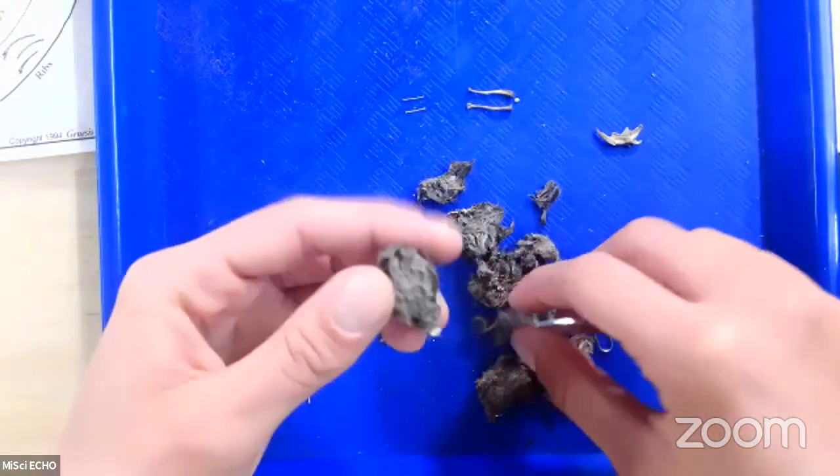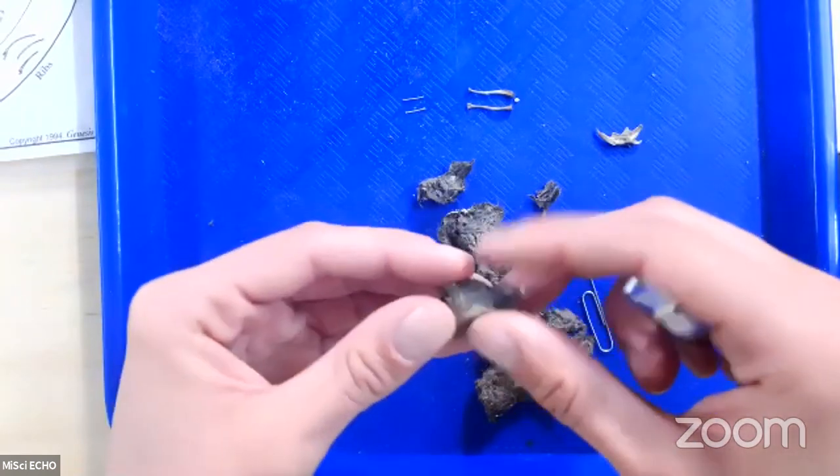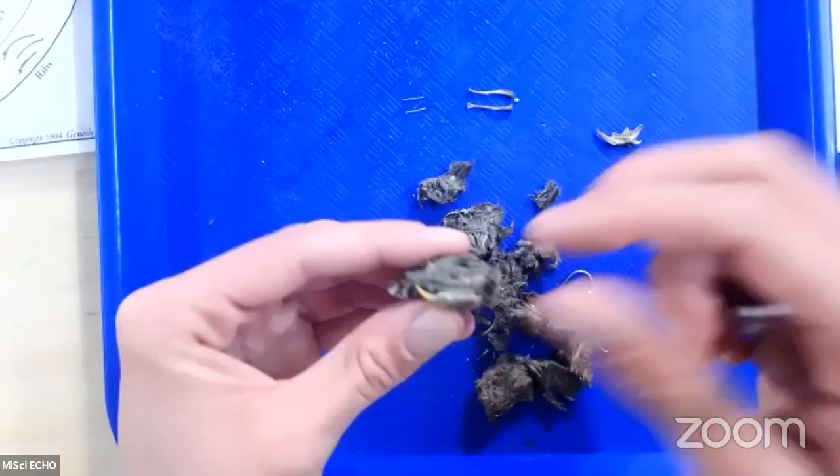Now, we won't have time to completely dissect this entire owl pellet today, and that's okay because I've done some work ahead of time. So we'll get to take a pretty up close look.